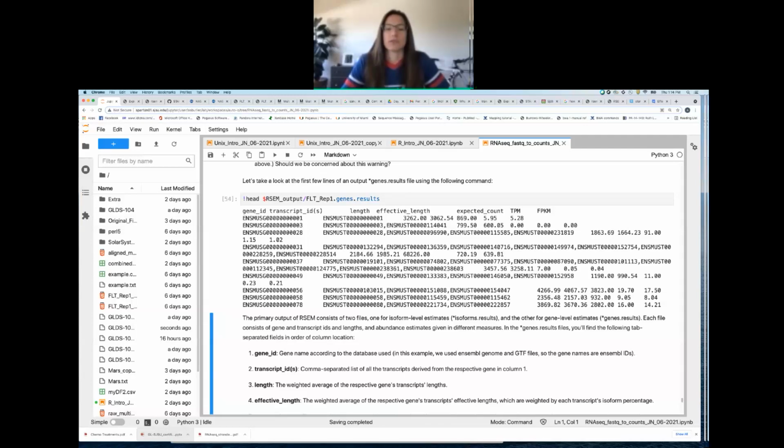And then tell me what the gene length of that third gene is. Yep, so that third gene ends in the 28, so we're looking at right here. And then we're looking at all those values there. So what is the gene length? Veronica, I think you're looking at the wrong line. So you're looking at the effective length.